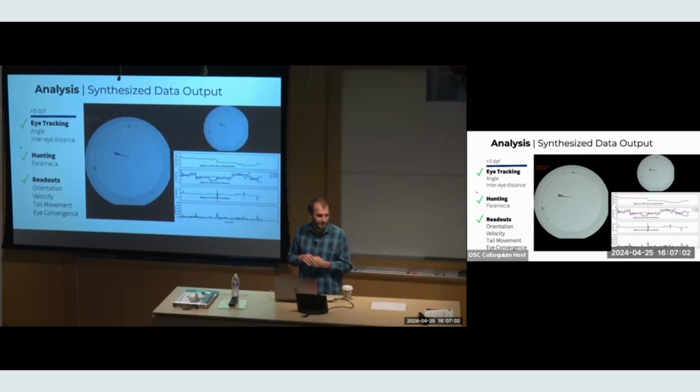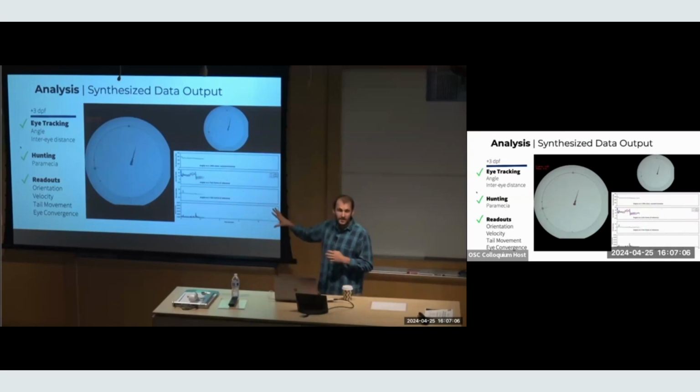Well, individually, just over and over. Yeah, that's what a standard approach would do with just a single microscope, if that makes sense. And you have to go from well to well, and if you have to take a 10-minute video at each well, it takes forever.